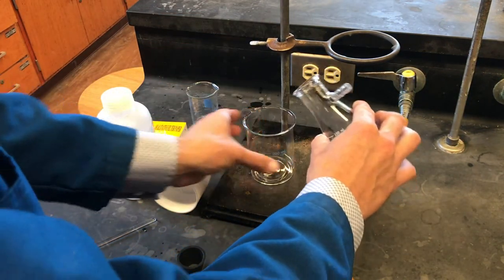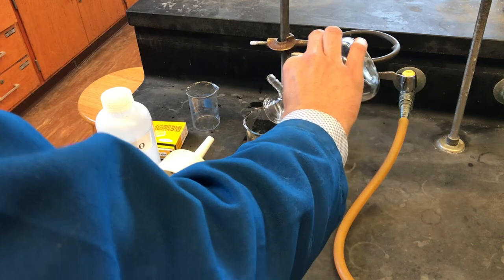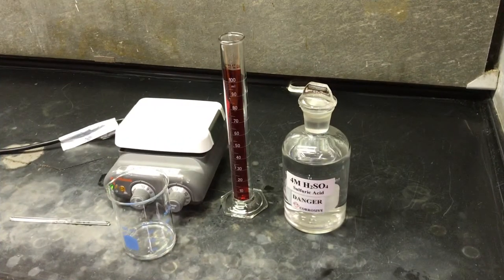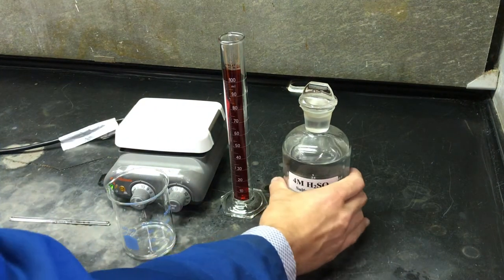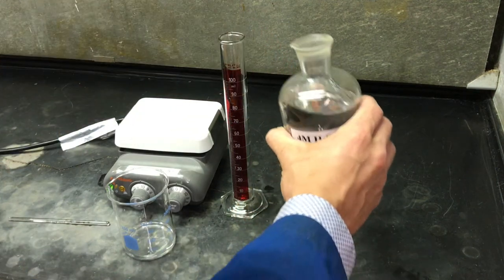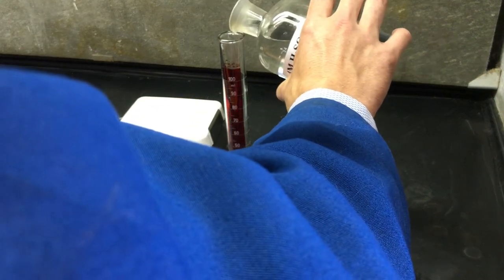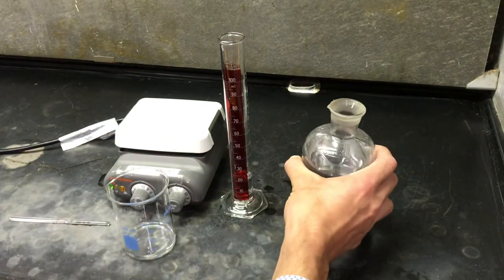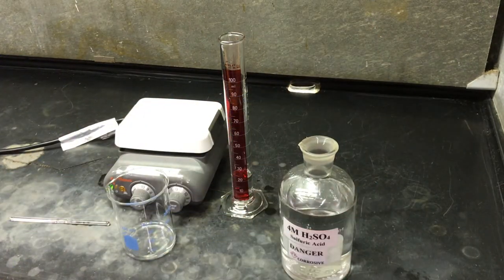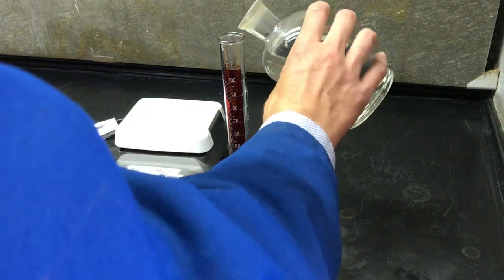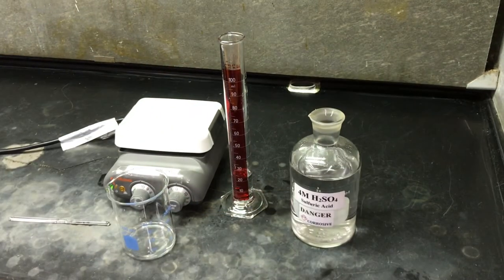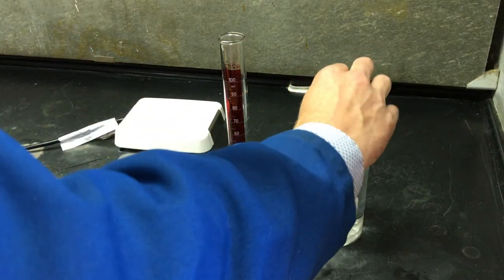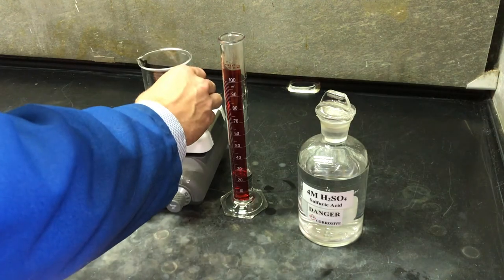We will now transfer our filtrate to a 250 ml beaker, which we will consider our reaction beaker. We will now react our filtrate in our reaction beaker with 4 molar sulfuric acid. Sulfuric acid is very corrosive and extreme care should be exercised. We will target 22.5 mL plus or minus 0.5 mL of H2SO4. We actually measure 23.0 mL of H2SO4 for our reaction.